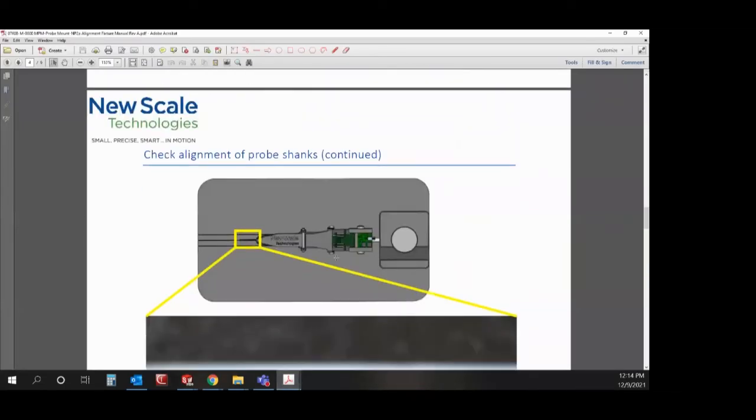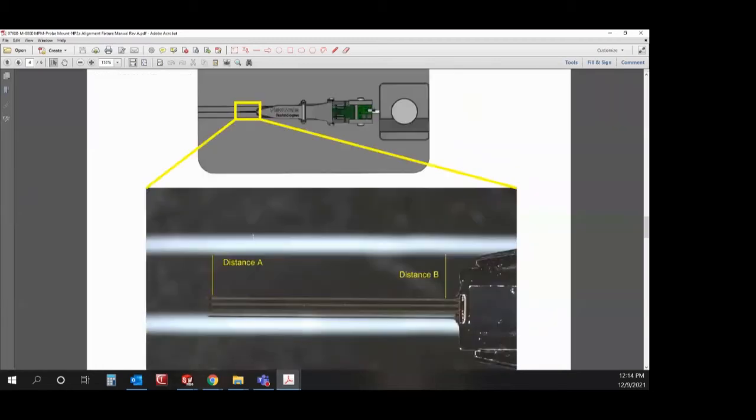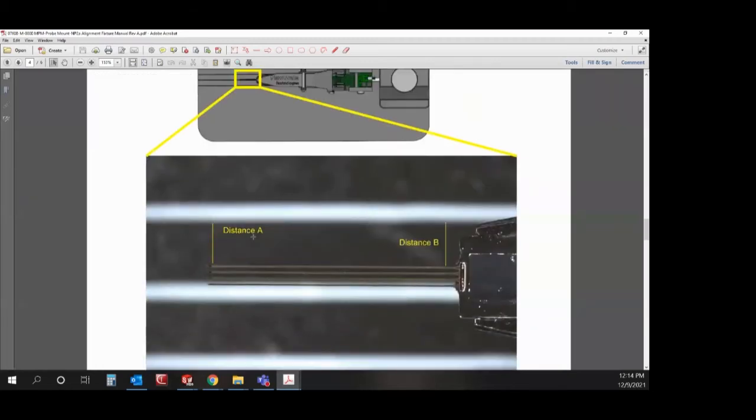Then you can rotate the probe 90 degrees and check for the other direction. This one was pretty well aligned.